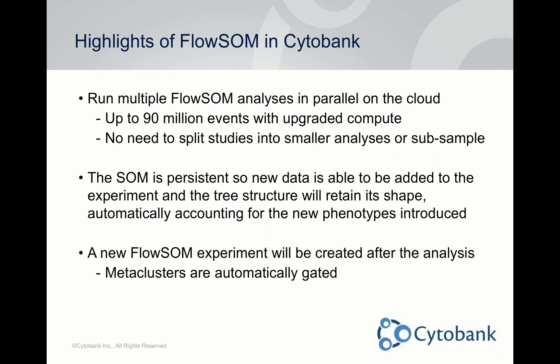In Cytobank you can run multiple FlowSOM analyses in parallel on the cloud — none of the calculations happen on your own computer. This allows you to run up to 90 million events with upgraded compute. You don't need to split studies into smaller subsets or subsample the data. The self-organizing map is persistent, so you can add new data and the tree retains its shape. The generated FlowSOM experiment with meta-clusters can be interacted with in the gating page or working illustration.